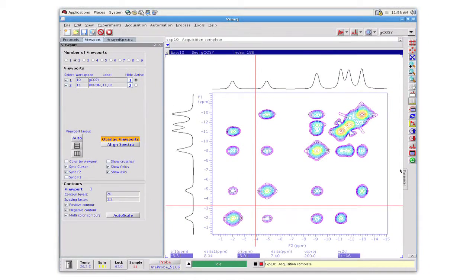As we have just seen, adding a boron and boron COSY button to the experiment selector is a fast, easy, and robust process. The new protocols are fully integrated with all the other features customers have come to expect from VNMRJ 3.